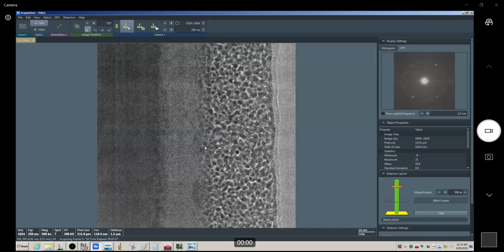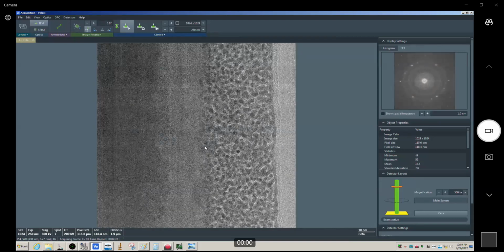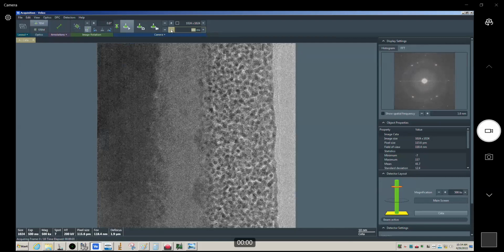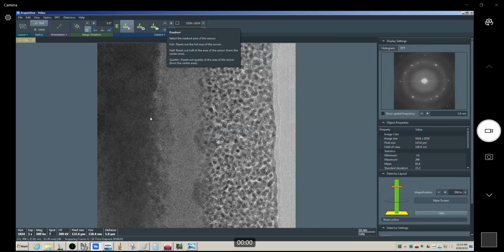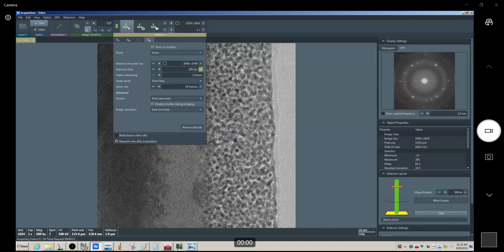All right, so you can see that's pretty crappy in terms of the signal to noise. So we'll go ahead and get a better focus here. You can increase the exposure time for the live image to aid with that, but I wouldn't go beyond a second. You can actually see there's a little bit of movement going on here. All right, so let's see, 100 milliseconds.